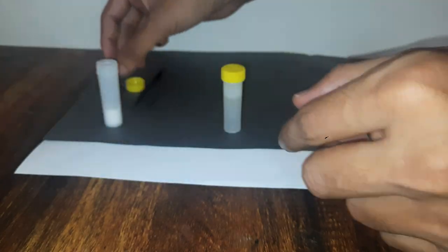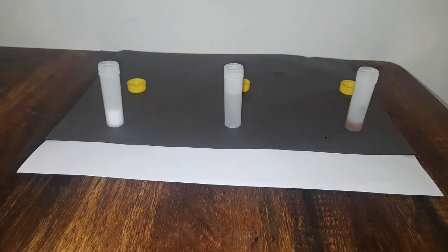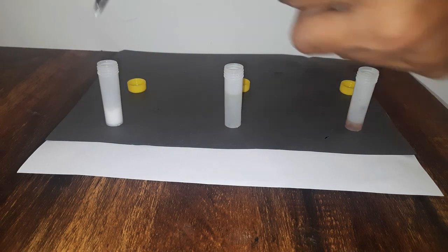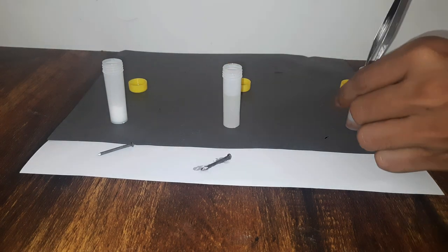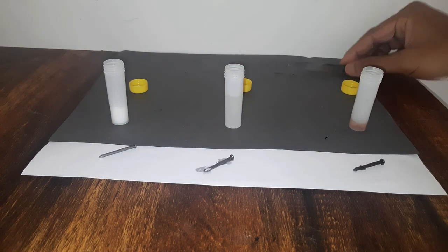Here we are after five days. I'll take out the iron nails. Here is the one from the baking soda — here is the one from the boiled water with a layer of oil on top — and here is the one from normal room temperature water. This first one kept in baking soda looks okay, it's still shiny, we don't see any coating on top. From any angle it looks like any other iron nail. So we can say no rusting really happened here.